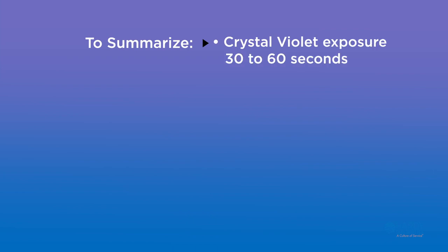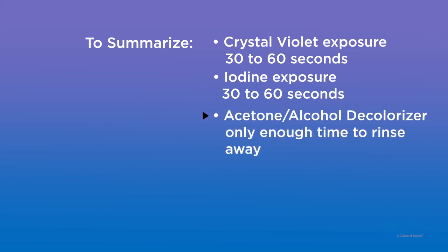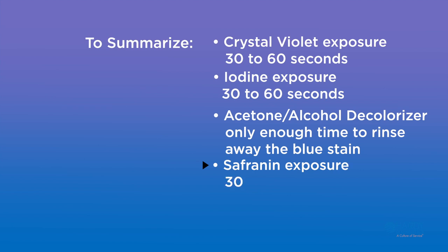To summarize, crystal violet exposure, 30 to 60 seconds. Iodine exposure, 30 to 60 seconds. Acetone alcohol decolorizer, only enough time to rinse away the blue stain. Safranin exposure, 30 to 60 seconds.